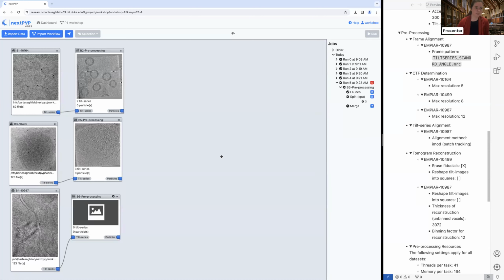And as that's finishing up, we could queue this block to ignore that tilt, but we'll show you how we would do that. So we didn't change any parameters here, but we did want to ignore a tilt. So you'll notice there's no star here. The block's not out of date, and I can't click this run button to get it to start.